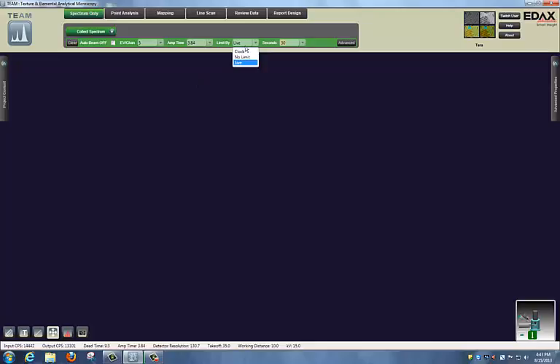Limit by allows you to select clock time, which is standard time, or live time, which corrects for the time lost to dead time processing. And the seconds is simply the amount of time that your spectra will collect for.